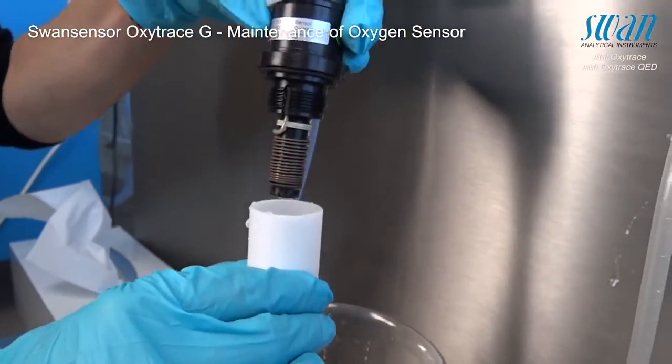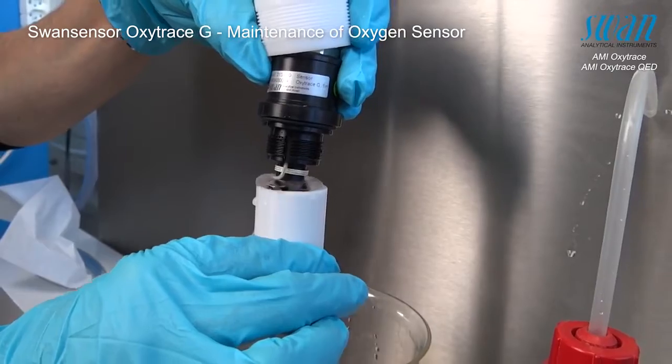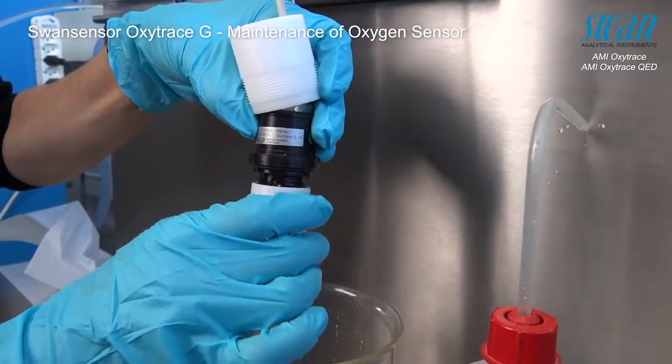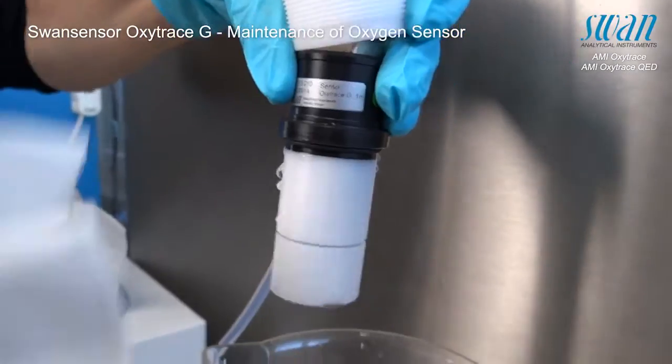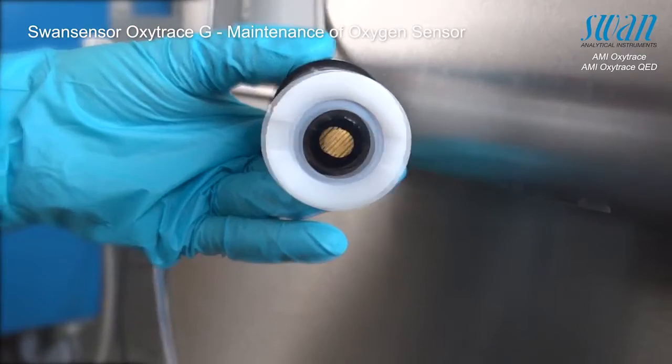Hold the sensor in a vertical position with the measuring head pointing downwards. It is important to avoid trapping any air bubbles inside the electrolyte. This can be done by carefully mounting the sensor cap onto the sensor.